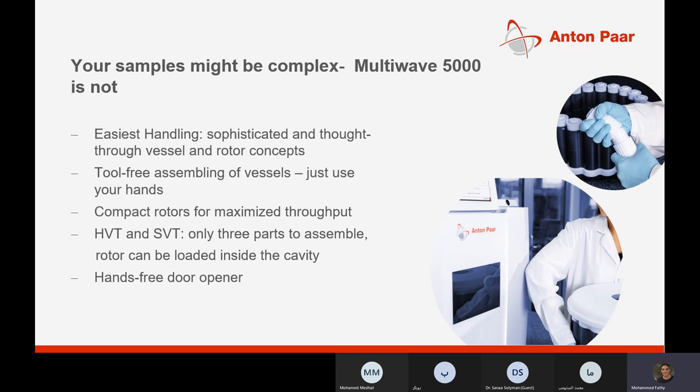One of the most common advantages of the MultiWave 5000 is easy handling — no need for tools to deal with vessels, rotors, and sensors. They are simple and anybody can handle them by hand without any tools. The door opens automatically after the test has finished. Two common types of rotors are the HVT and SVT, consisting of only three parts to assemble, and we will see later how easy they are to replace and assemble.